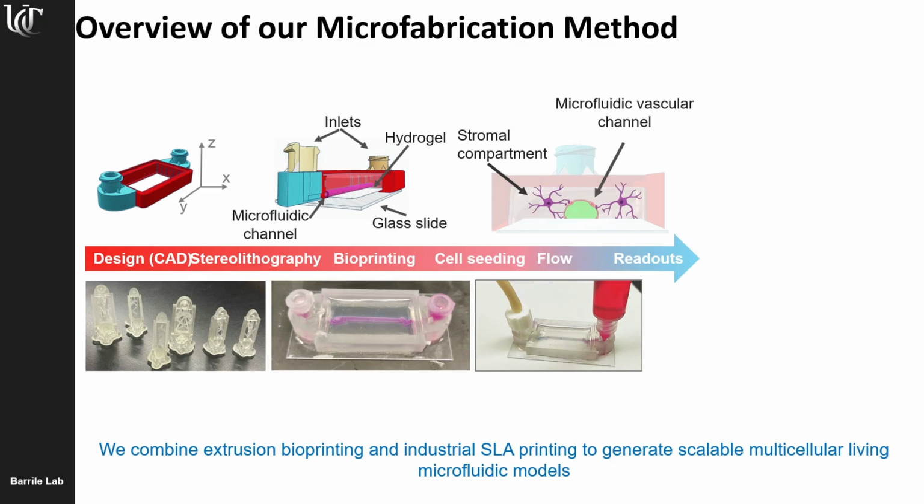And this microfluidic scaffold is further interfaced with a microfluidic hydrogel that we generate with the Pluronic method I briefly introduced before. We print a line of Pluronic, we cast a hydrogel, it can be fibrin, it can be collagen hydrogel, that polymerizes, and you end up with a microfluidic hydrogel that is now interfaced with a rigid scaffold that also holds these inlets as per design. They're here. And so the inlets can be easily connected to microfluidic systems, as in the picture, and connectors.